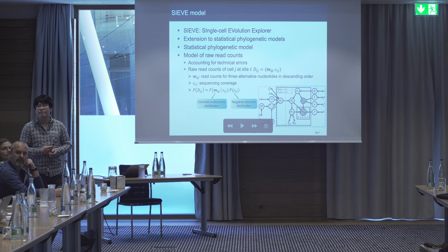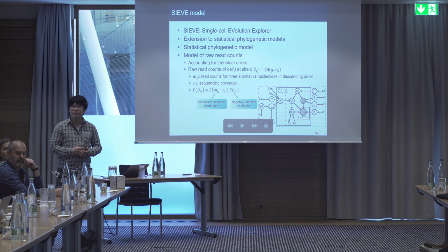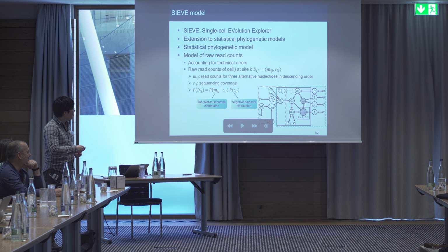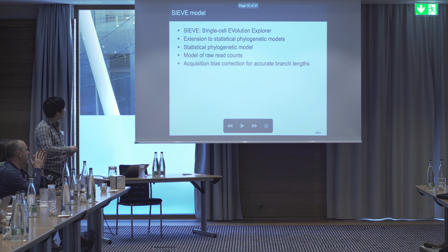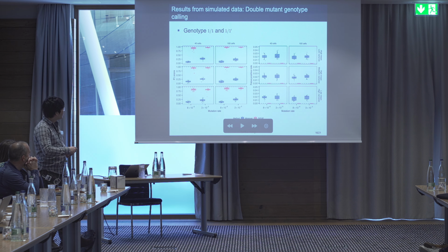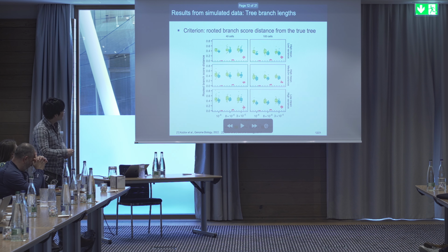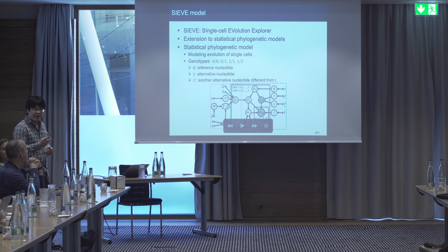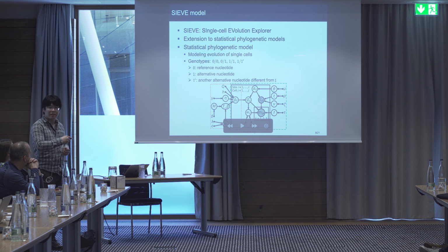Can you explain a bit more how, and also first why you detect the double mutant genotypes, and why Monovar doesn't? Or even how do you try to detect double mutants using Monovar? Maybe you can use these slides from the synthetic data to explain it better.